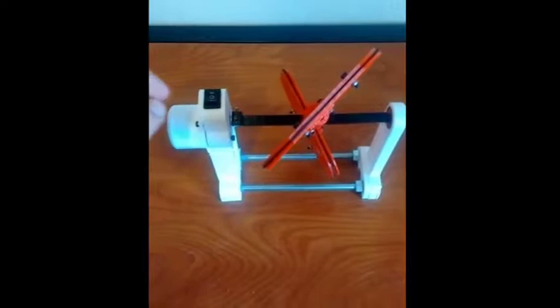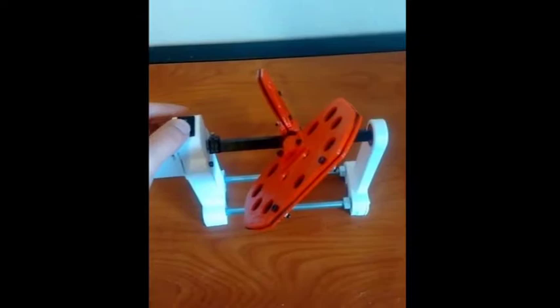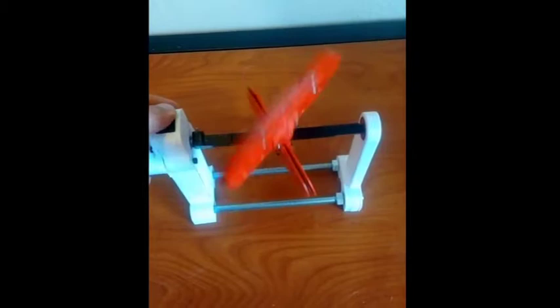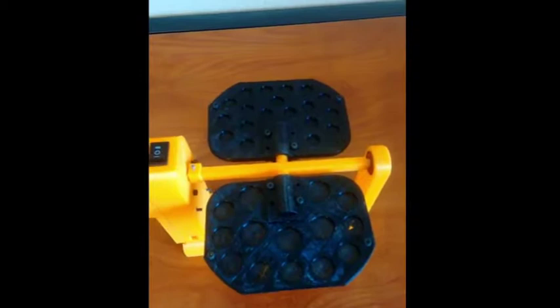Hello everyone. We are trying to assemble the 3D printed sample rotator developed at Michigan Technological University under Dr. Joshua Pierce. This is how the assembled version looks and operates. It is a lab sample rotator that can take in test tubes of varying sizes, and this is another version of the similar product that can double up as a laboratory shaker as well.